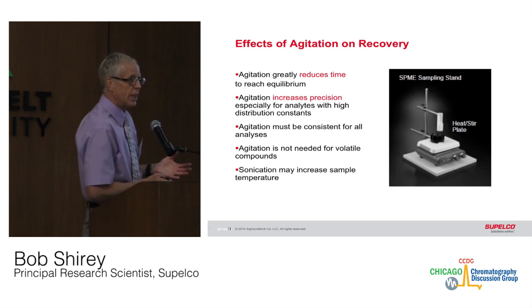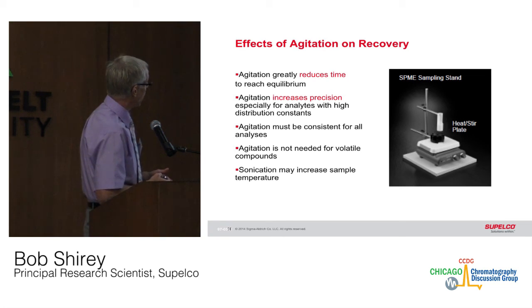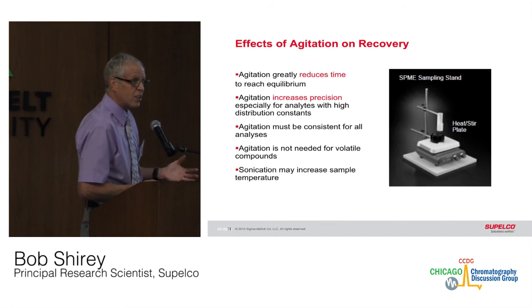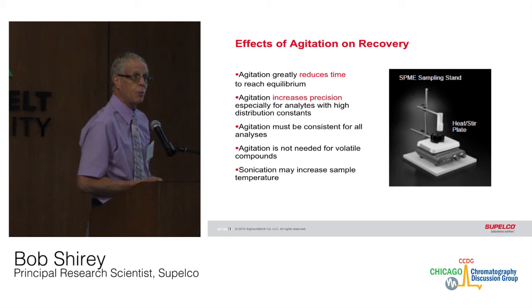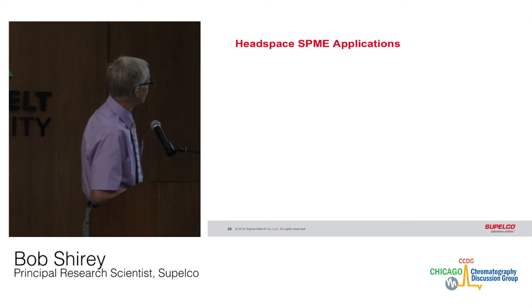Agitation is essential, especially for larger analytes. It reduces extraction time. It increases precision. But it's important that the agitation be consistent. It's not necessary for volatile compounds, but most of the time I still use it. And beware of sonication, because you may increase the temperature of the sample, which could change the recovery.